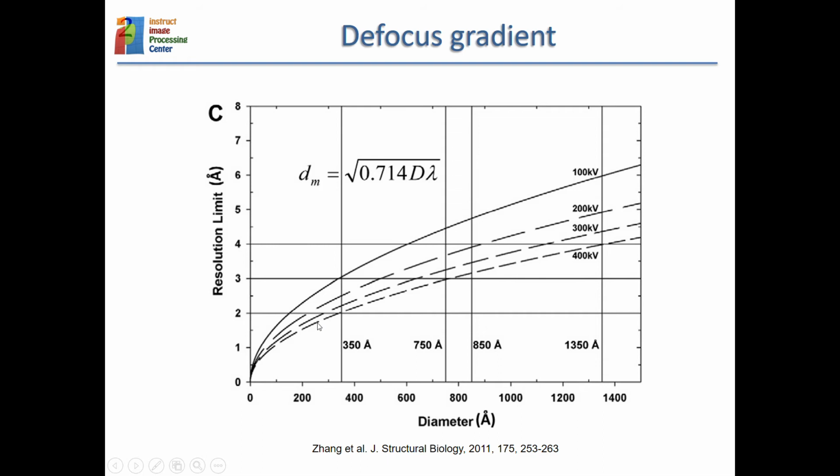So if you want high resolution for large objects, you need to correct and to account for these small differences in the focus.